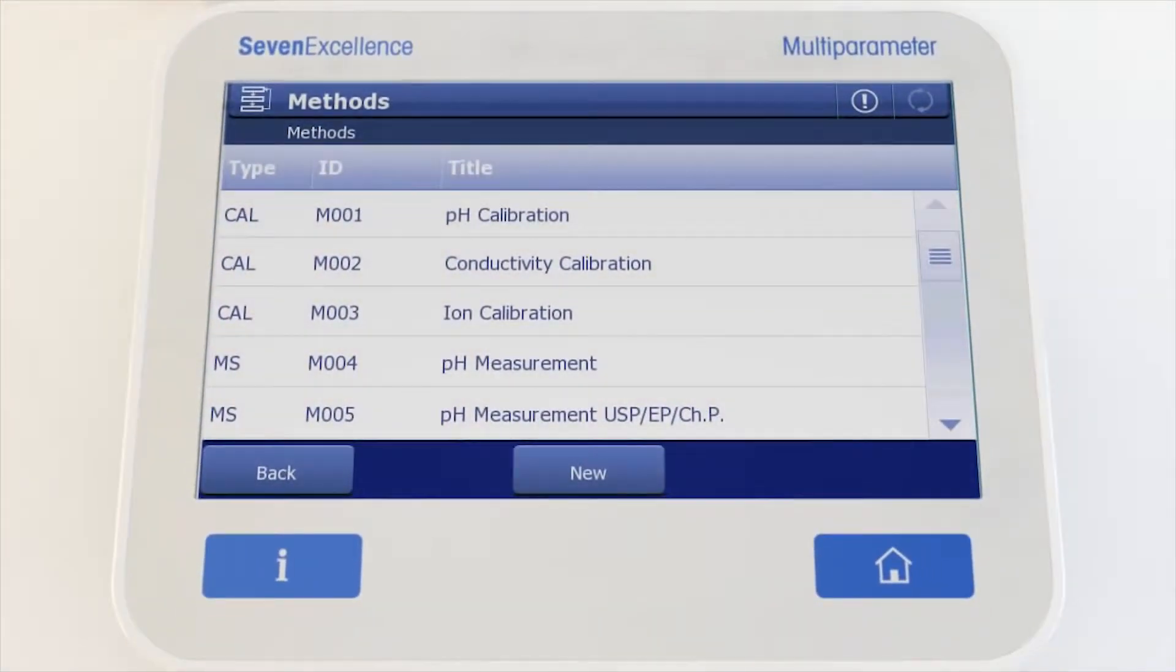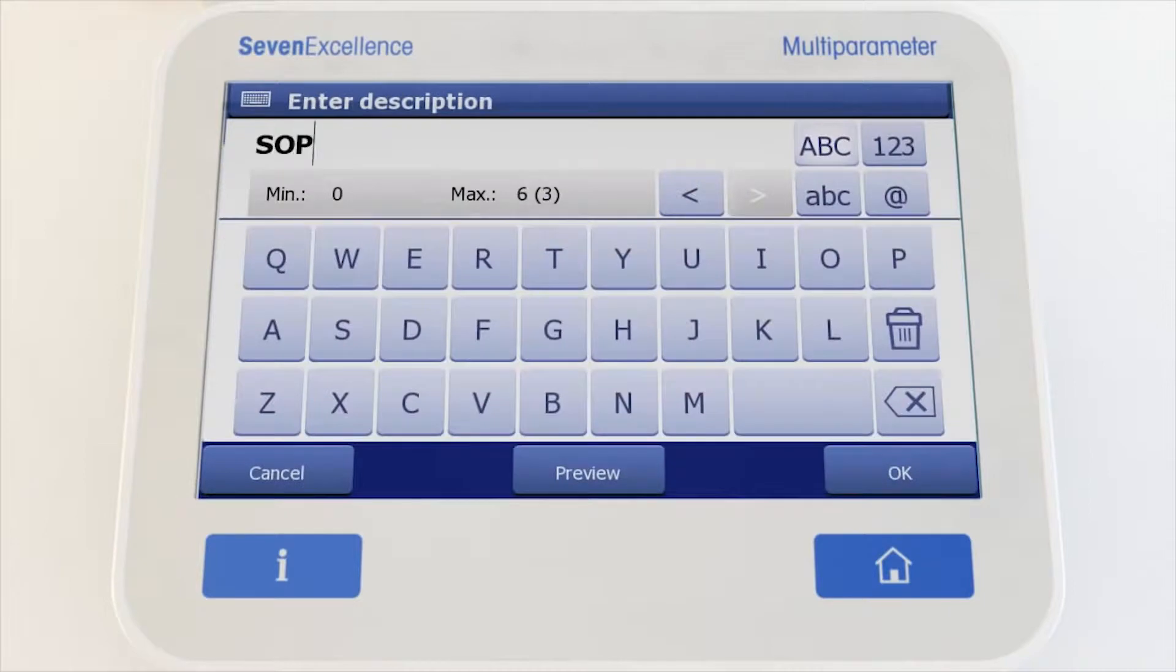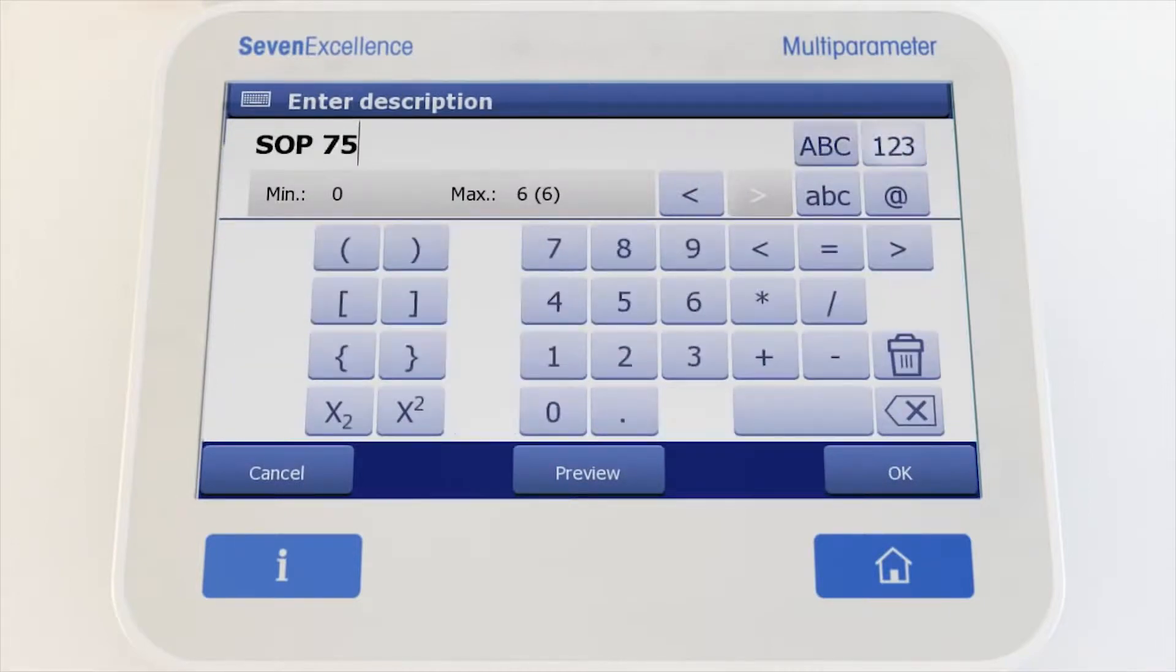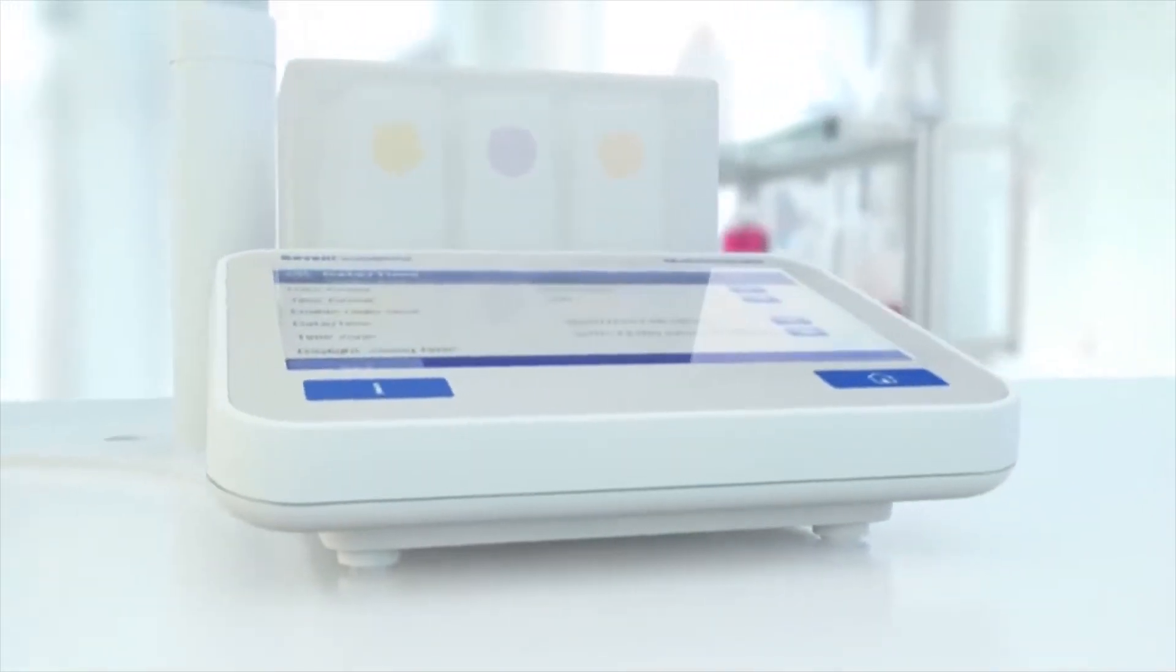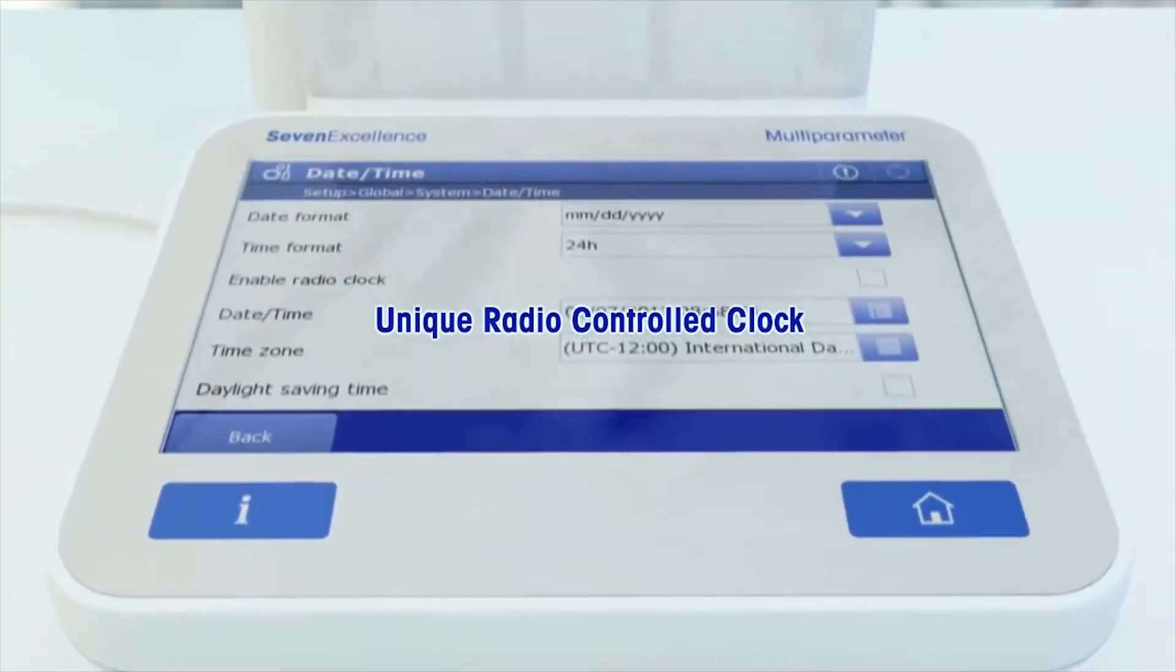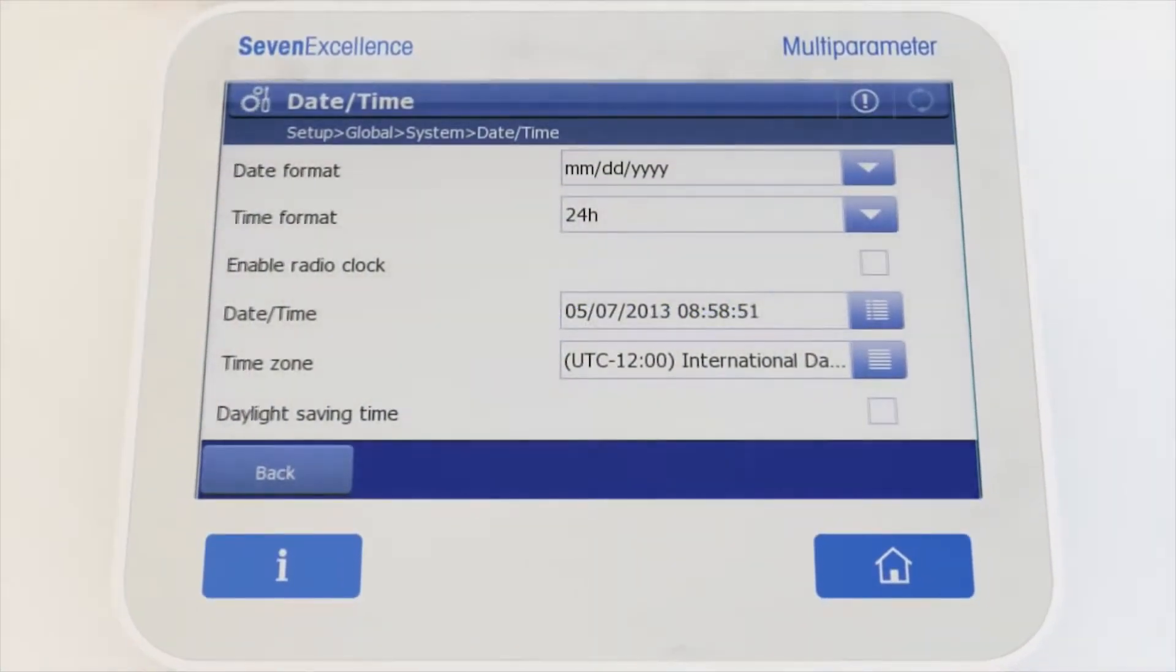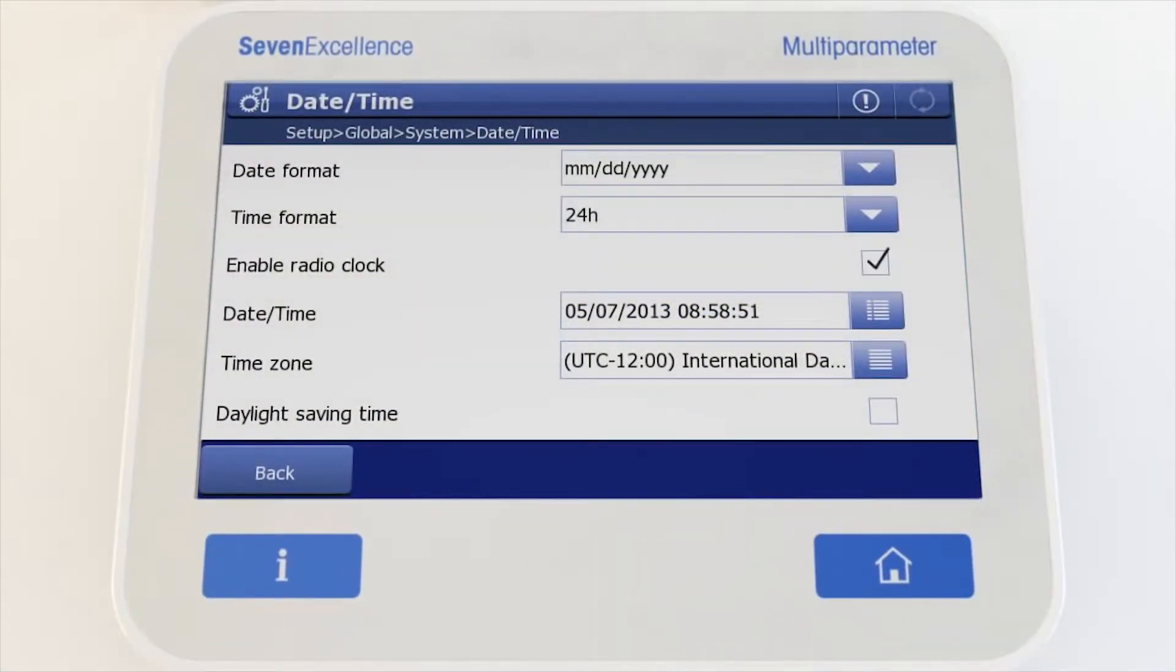Program your SOP as a SevenExcellence method and ensure that each analysis is performed under identical and correct conditions. By a single tap on a customized shortcut, authorized users can start a method quickly and safely. One click.